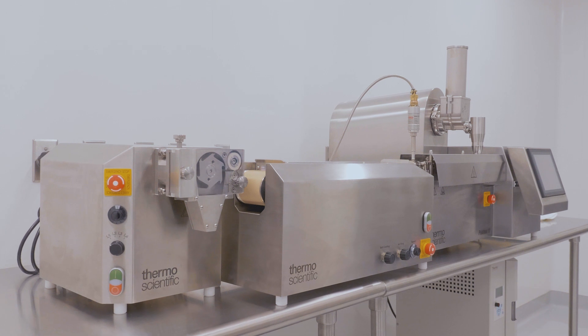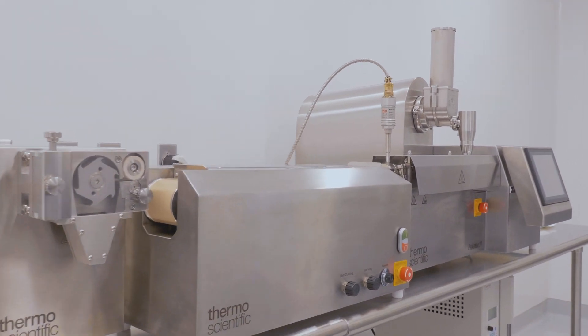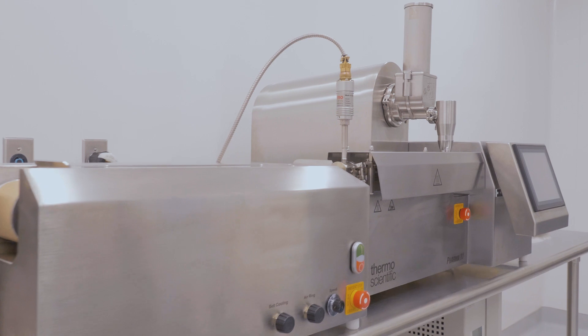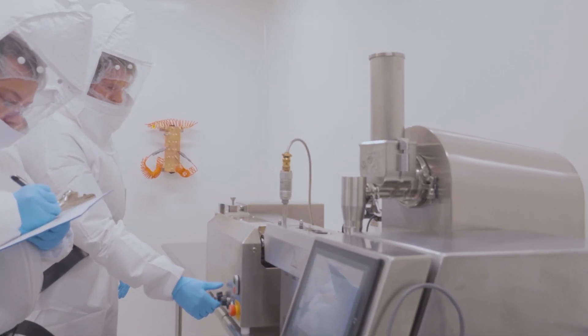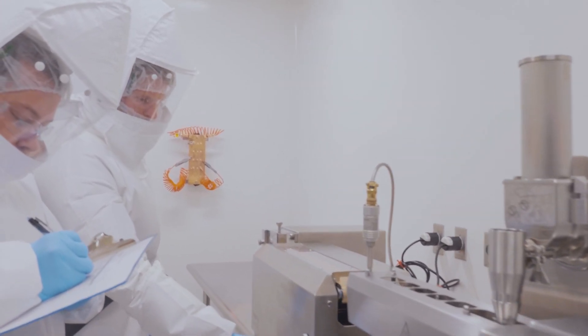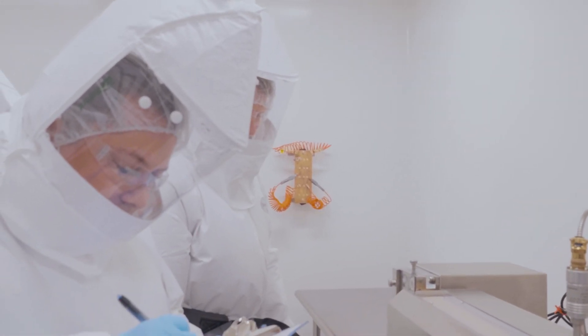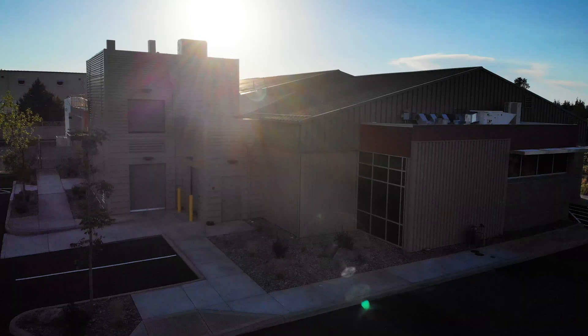Quadrant II is a platform that we developed here at the Bend, Oregon site. Our Quadrant II platform helps in identifying which is the right technology for poorly soluble compounds. Another unique aspect of Quadrant II is it is fully predictive and it requires only the structure and the physico-chemical properties of the API, such as the melting point. With that simple information, we can help in identifying the right enabling technology as well as excipient selection for formulation.